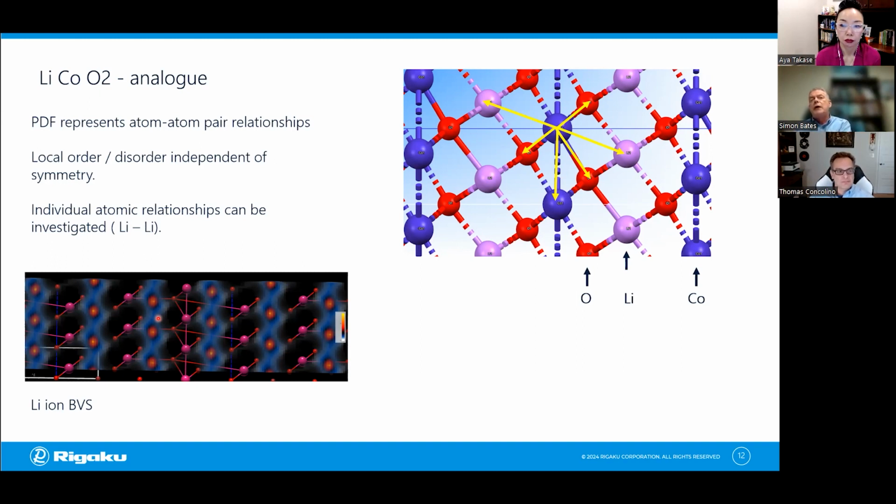Essentially it's based on the valence state. So it's cobalt 3 plus, lithium 1 plus, and oxygen 2 minus. So it takes in that ionic valence state and the ionic radius. And then based upon those two, it looks at all the positions where the energetics can be satisfied to satisfy valence and can satisfy the ionic radius. Based upon that, it finds a free pathway where the lithium can move through. So lithium can actually sit in many positions and still satisfy all the valence and bonding relationships, which is really quite interesting.